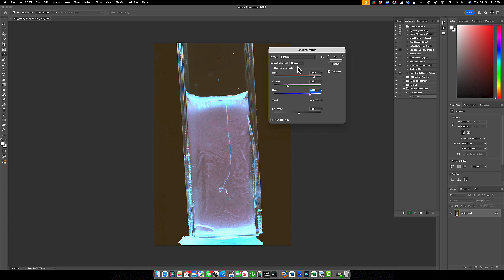So this isn't necessarily hyperspectral imaging. We didn't use a hyperspectral camera at all, but we still have a good amount of spectral data that we can play with in order to achieve a specific result. And this specific result is merely just the structure of the root. That's the only thing that we're interested in. We don't need color accuracy. Color is not what we're after when it comes to this root, and let's just say we were interested in that information, we still have the original photographs to base that off of. So it's not necessarily important for the 3D modeling portion of this study.